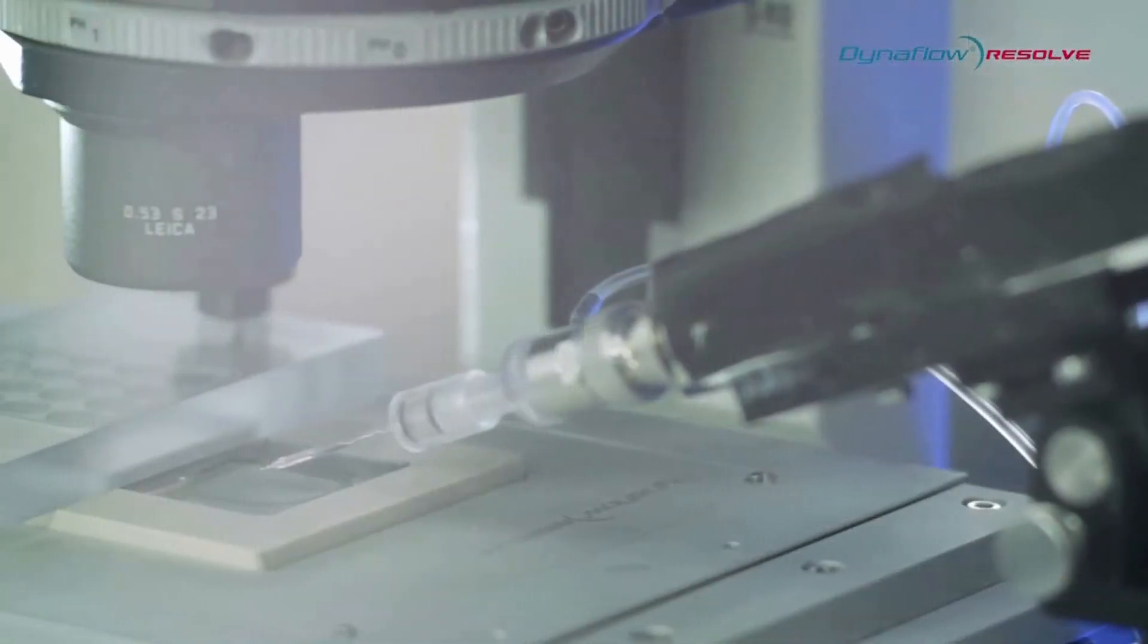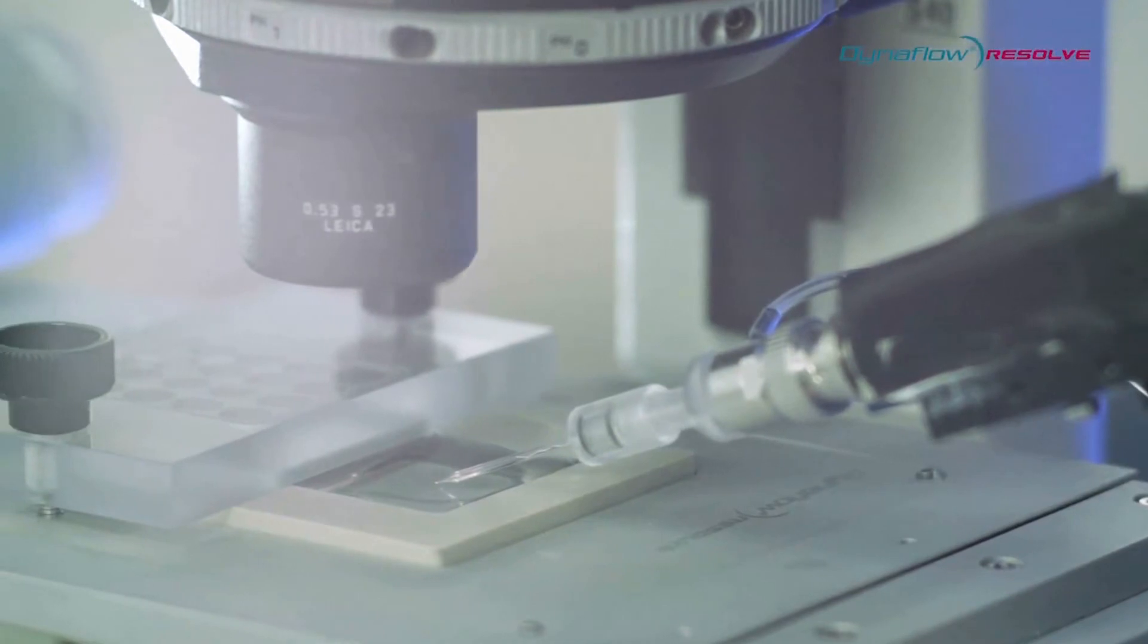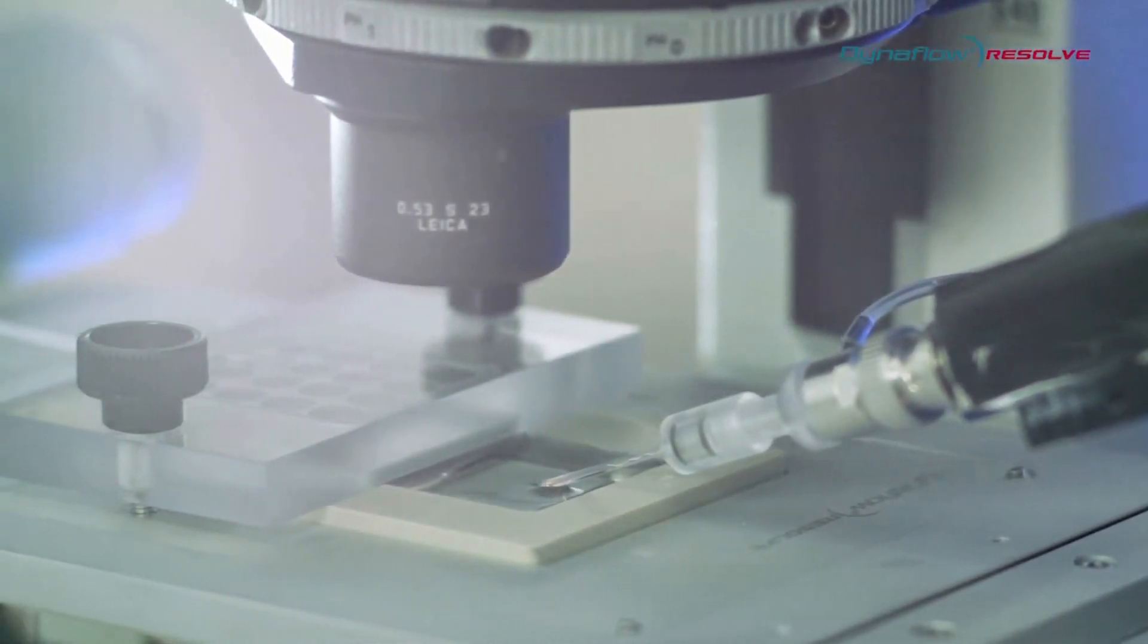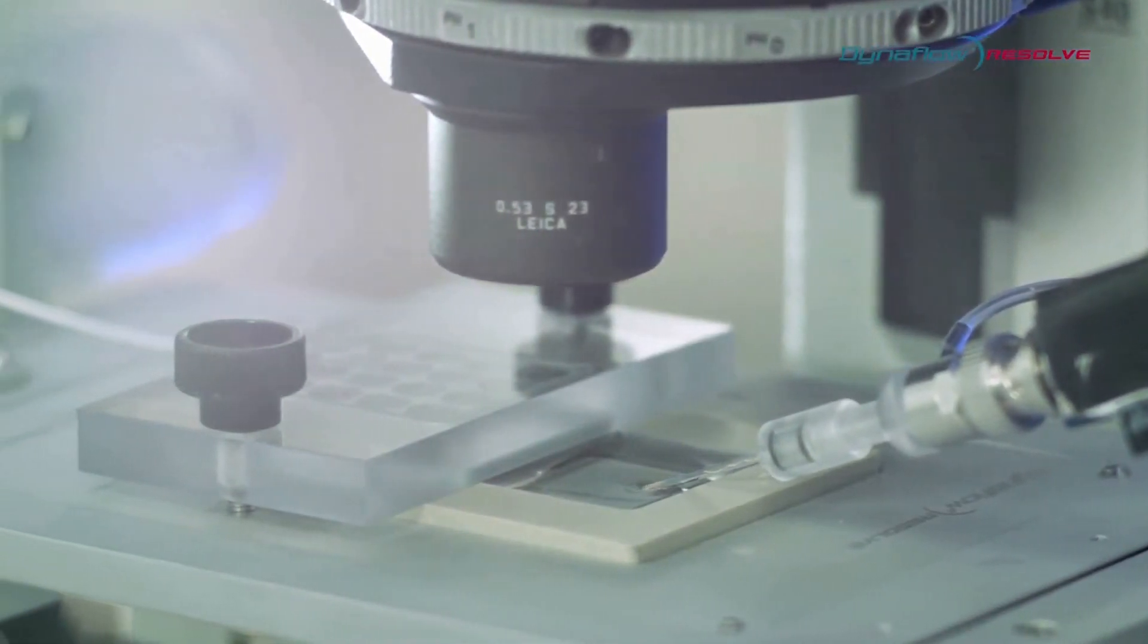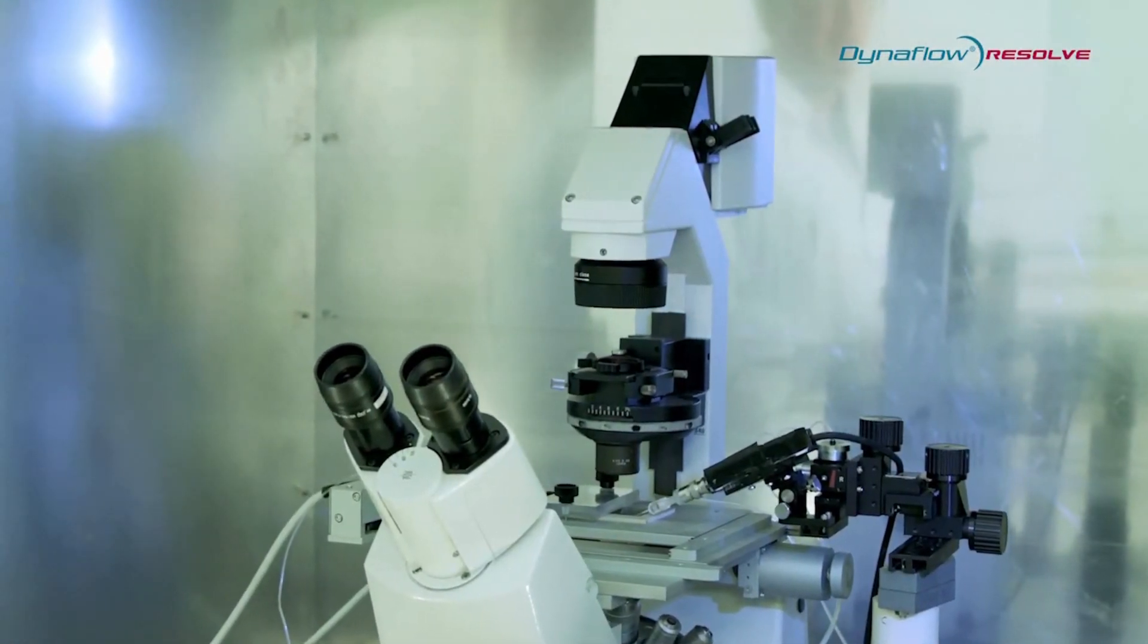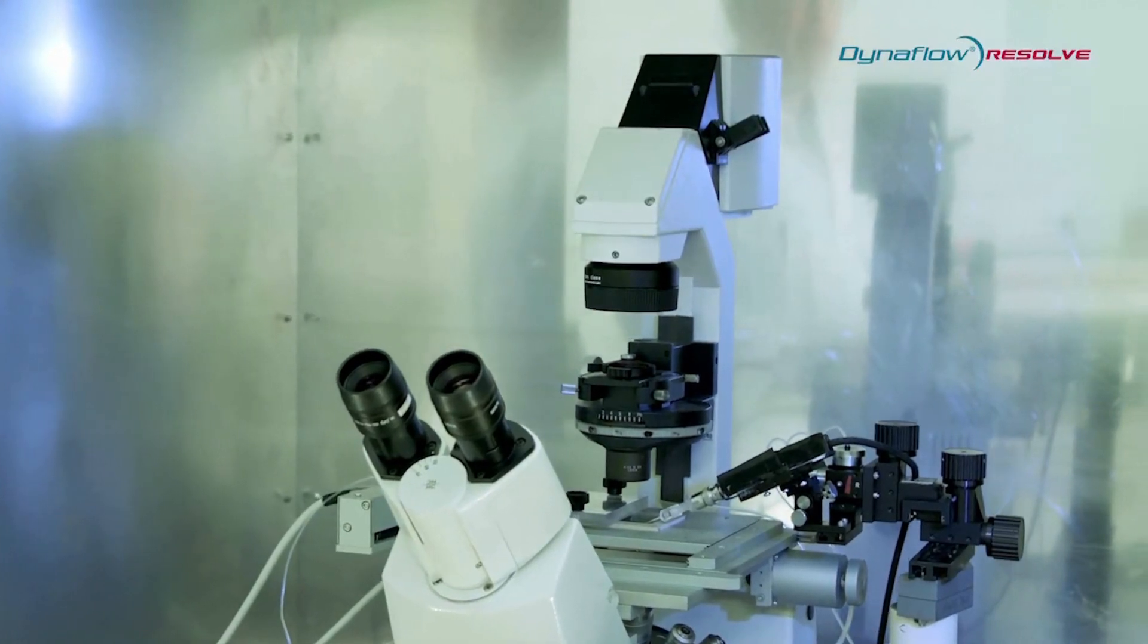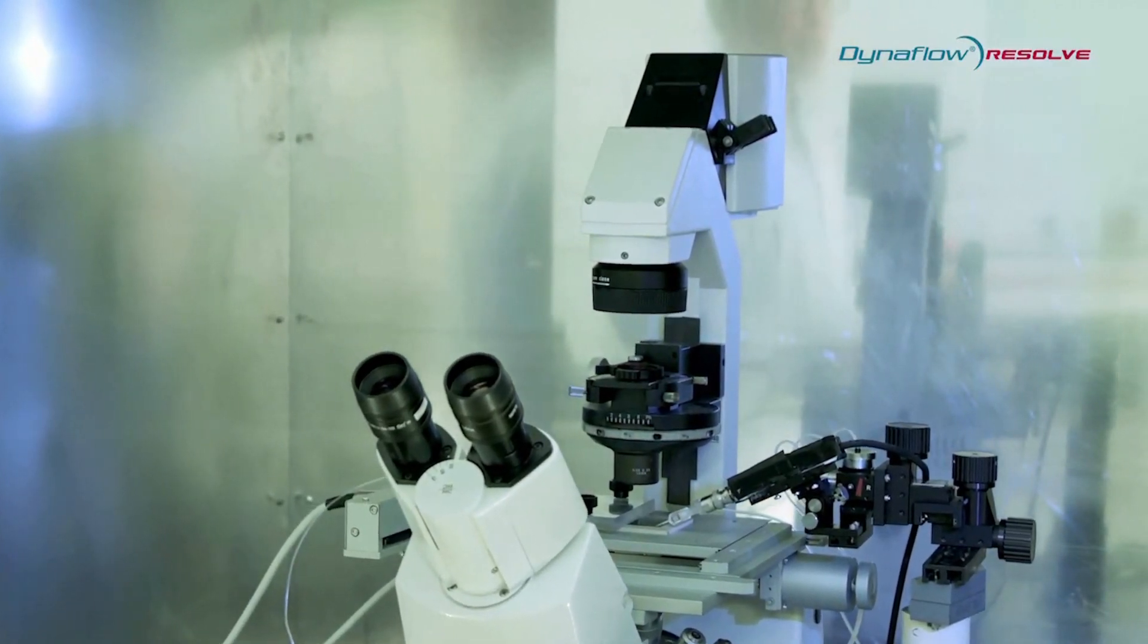It's very easy to upgrade your patch clamp rig with the Dynaflow Resolve system. The flexibility of the system, along with the stability of the experimental parameters, makes it an ideal platform for conducting advanced patch clamp experiments using any compound, patch configuration, and cell type.